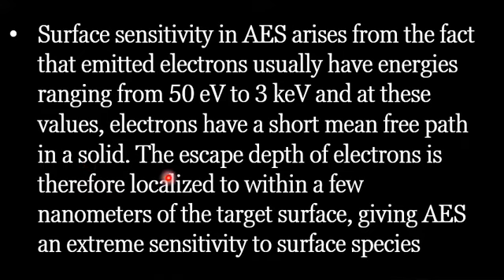The escape depth of the electron is therefore localized to a few nanometers of the target surface, giving that Auger electron spectroscopy is extremely sensitive to surface species.